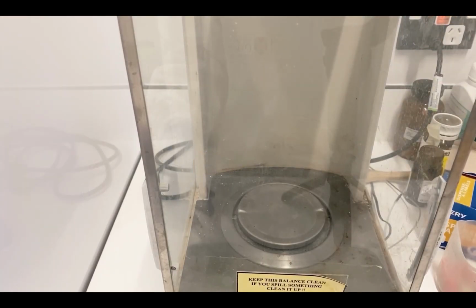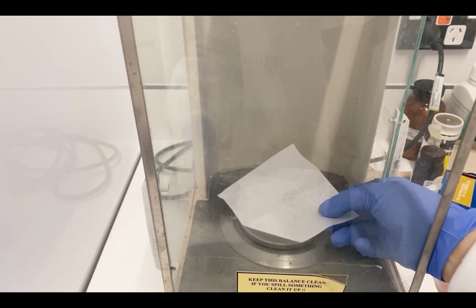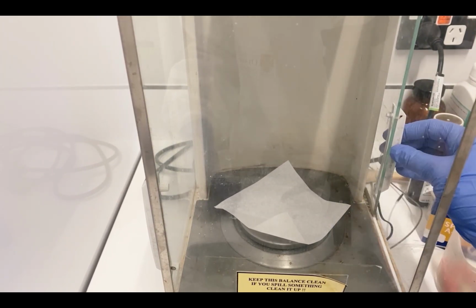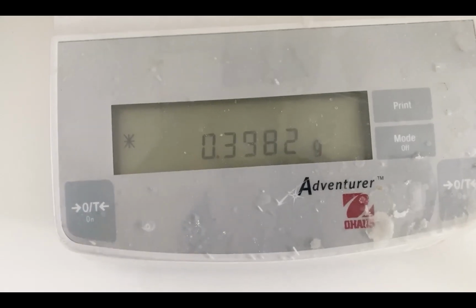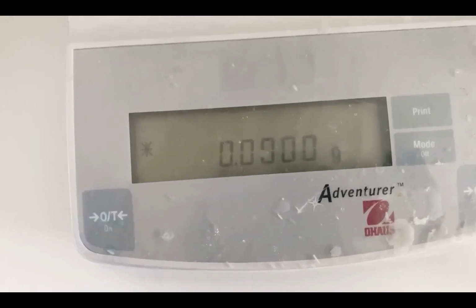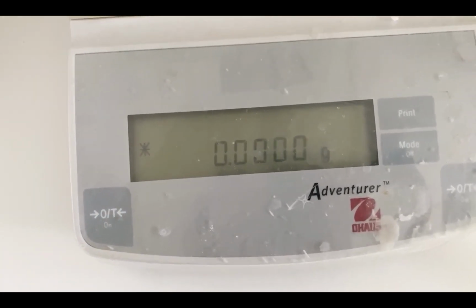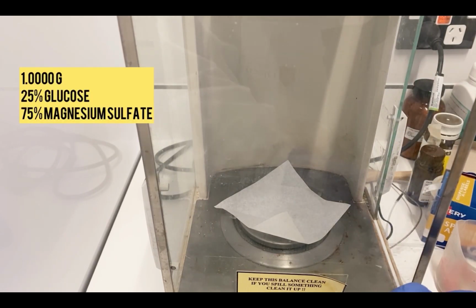Now that we have our materials ready, let's start by placing our folded weighing paper on the balance pan. Close the balance door while weighing an object in order to prevent air currents from disturbing the reading. Press the tare button to reset the weight to 0. For this demo, we will prepare 25% glucose and 75% magnesium sulfate.